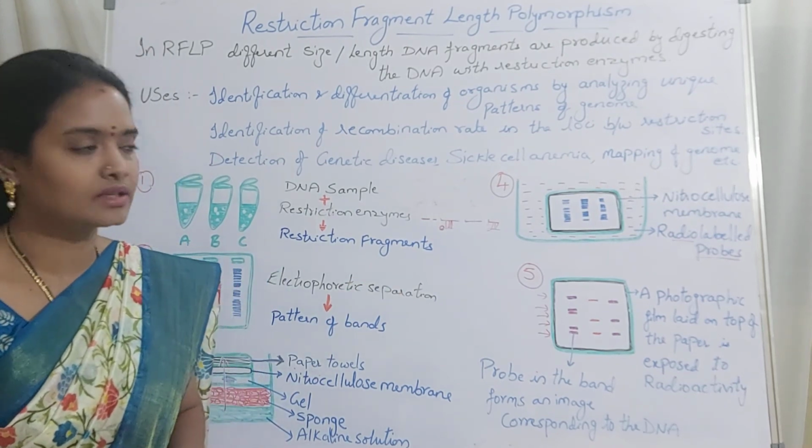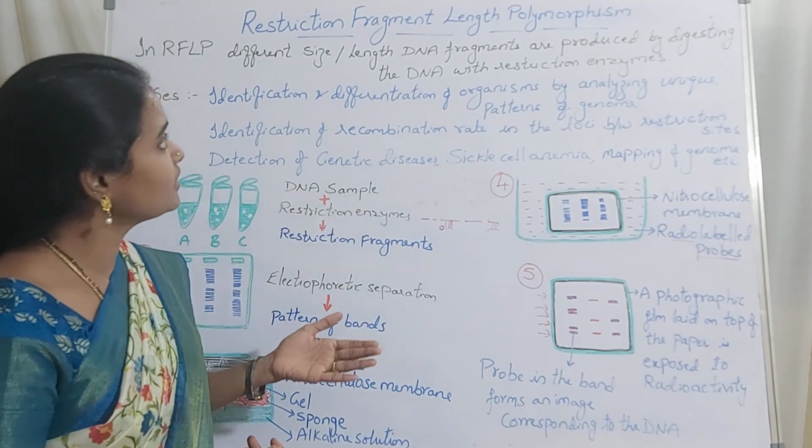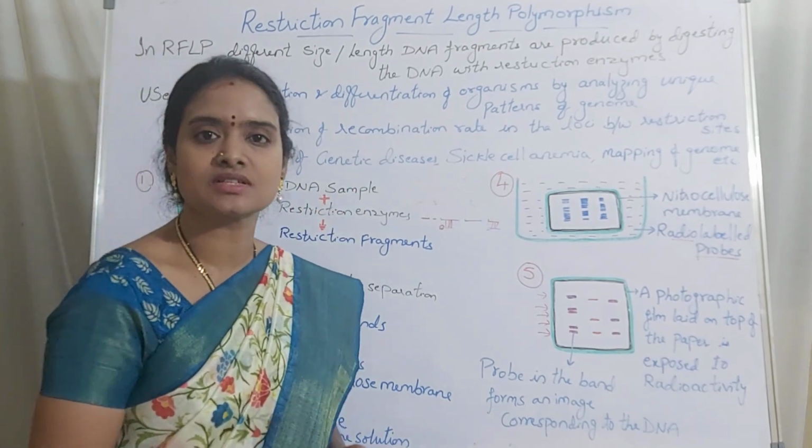All the techniques require these restriction enzymes, and this RFLP is further modified, which we'll discuss in the next class.